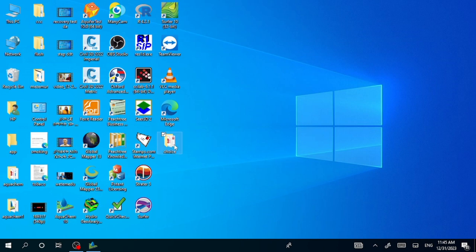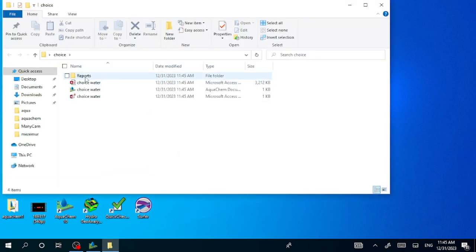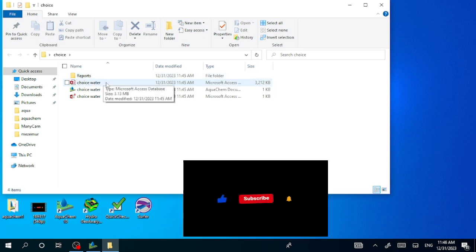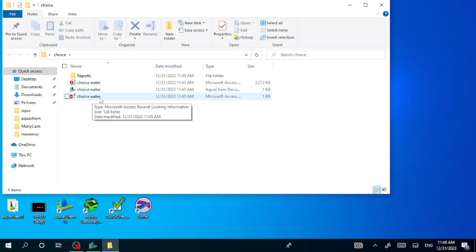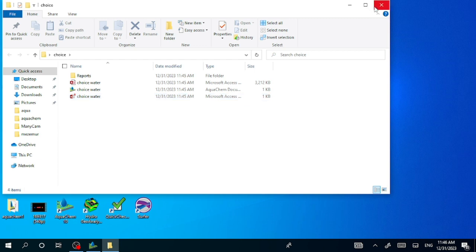Here is where the project is located — in the folder. If you open this one you will get the content report. Choice Water is the project name.